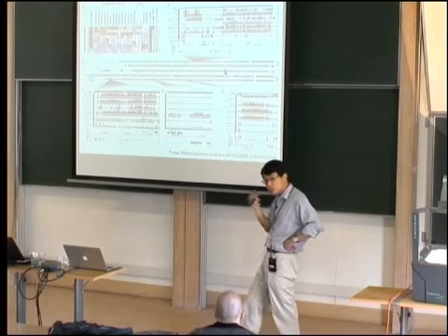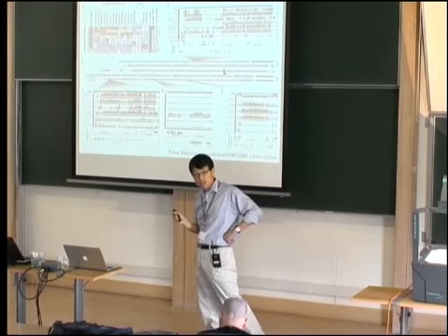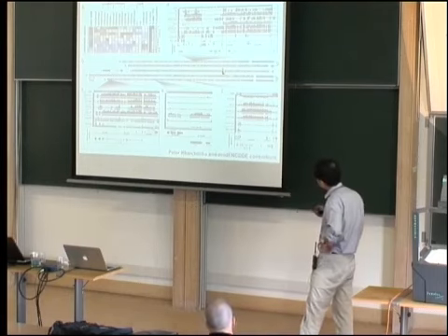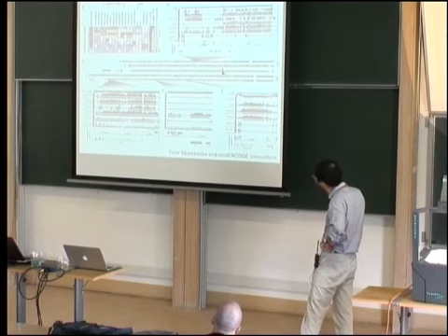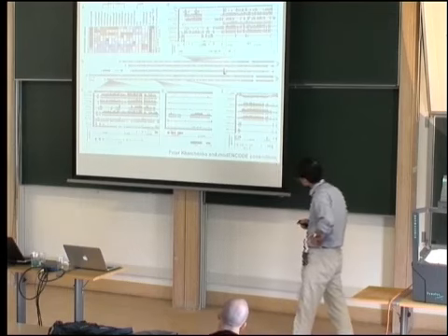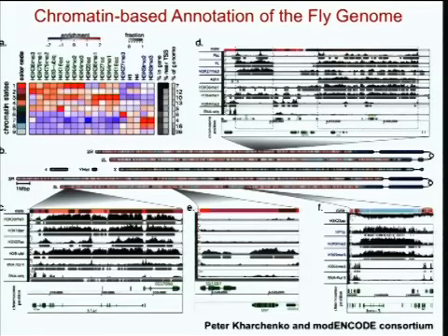But in terms of their histone modification patterns, they're quite different. Okay? And so on. This is a heterochromatin mark. In Drosophila, the 4th chromosome is actually very interesting. It actually looks a bit like heterochromatin and euchromatin at the same time, depending on which features you look at. So by profiling with all these histone marks, we can learn more about exactly why it carries certain features.